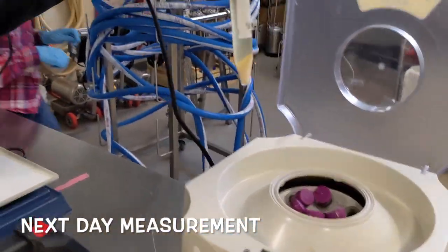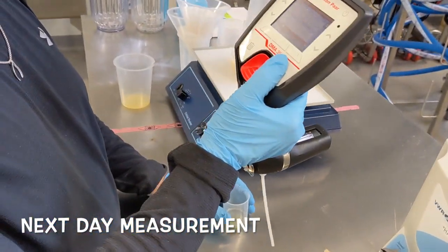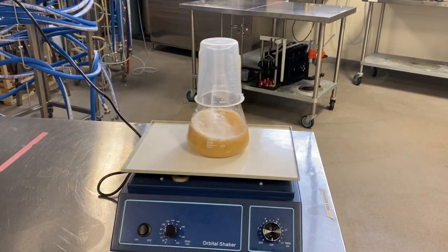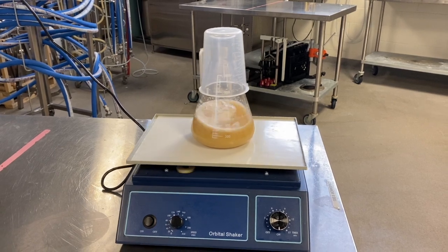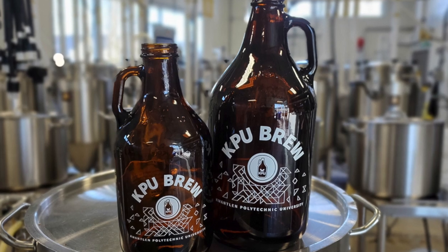After decarbonating the fermented wort and removing the yeast by centrifuging, run the sample through a density meter. The results will provide an estimate of the final apparent extract expected from the fermentation process.